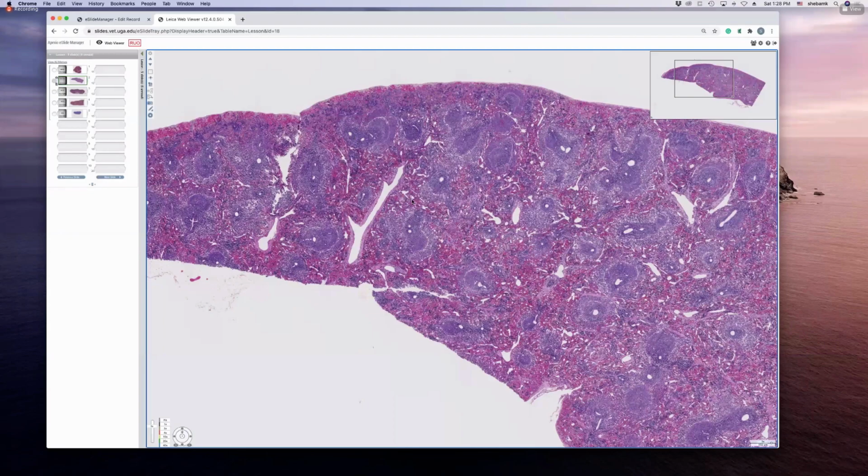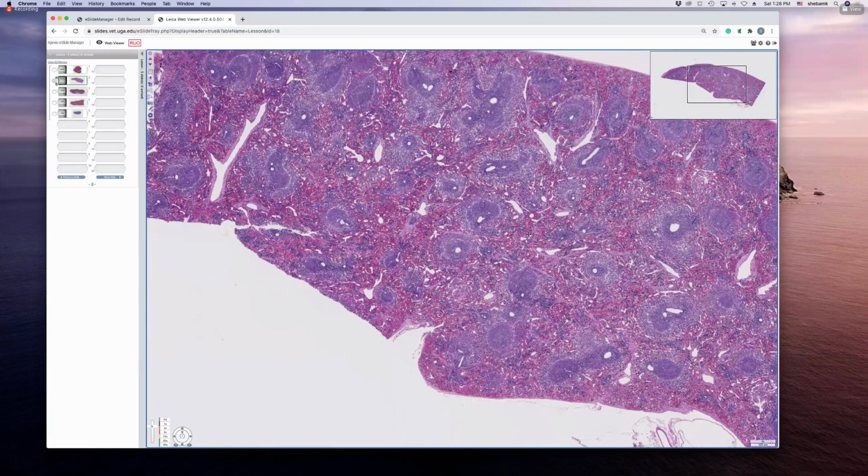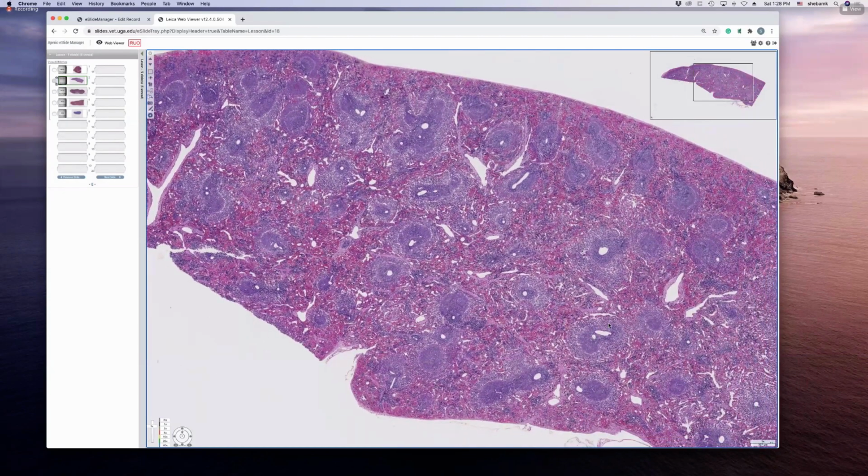These branches are going to be covered by lymphocytes, like a lymphocyte covering right here, around this vessel, around this vessel, around this big vessel here. So what do we call this lymphocyte covering this vessel?